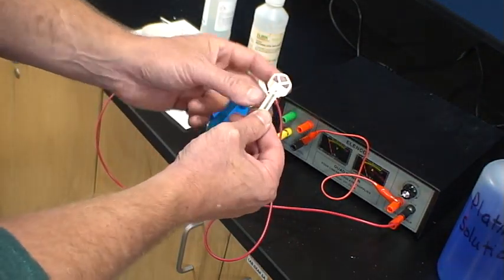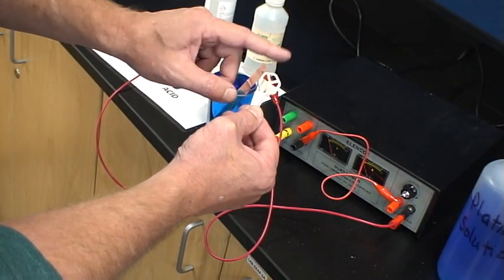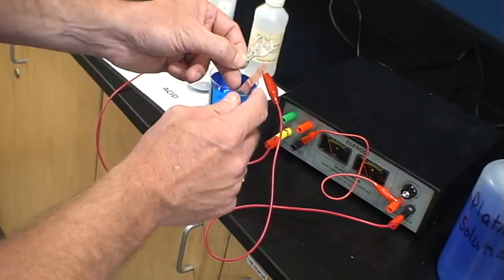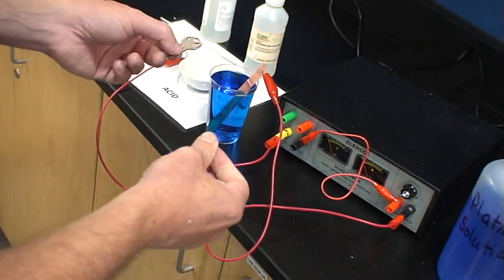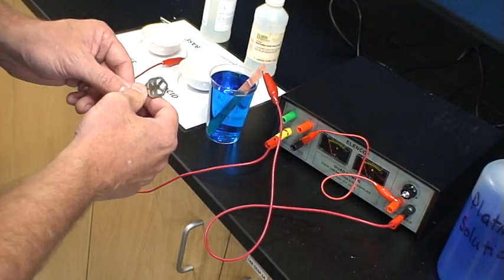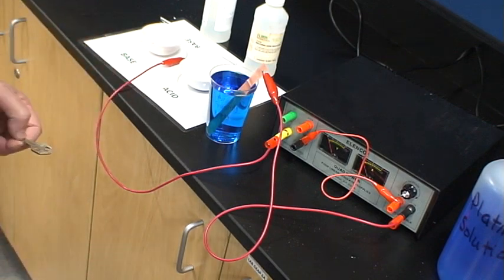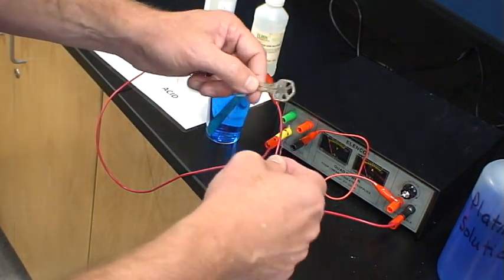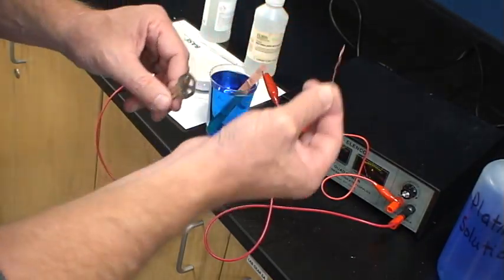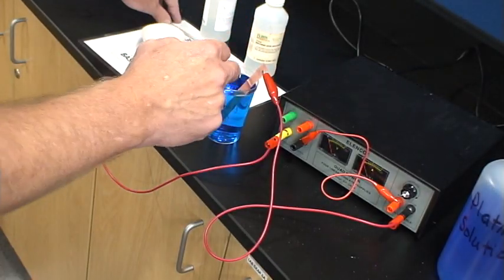Now this is a metal key, and I'm going to be forcing the copper ions, through adding electricity, to actually plate on here. We can figure out the mass of copper that's going onto here and apply Faraday's equation to calculate exactly how much has been deposited. I've also washed off this key with my base and my acid, and so we just have to have a method of taking the metal and dangling it down as well. So I have a copper wire in here. I made just a little hook so I can retrieve it a little bit easier.